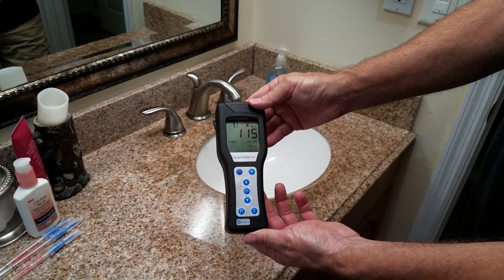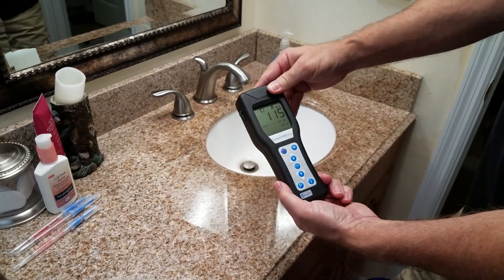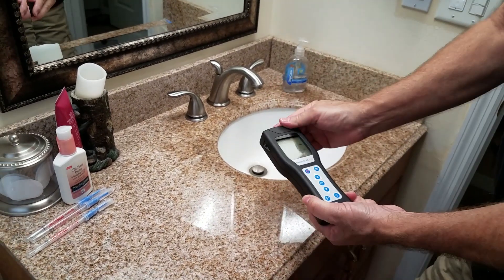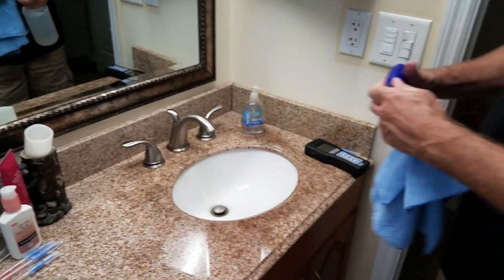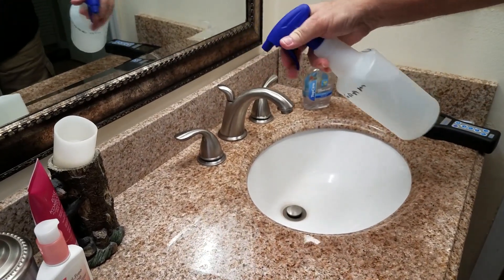So that's not that dirty — I've done other surfaces where there are thousands of light units. 115 is not bad. What we'll show is if we spray a product on it, it'll kill germs and viruses better than typical bleach.